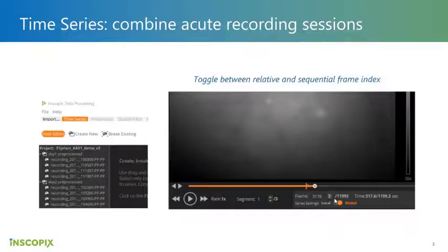Thanks. Do you think this may be something we can do through the API? We could just rewrite the timestamp, which might solve the problem, since we do have the cell set or movie write function. Basically, recreate or modify the movie and save it as another file.